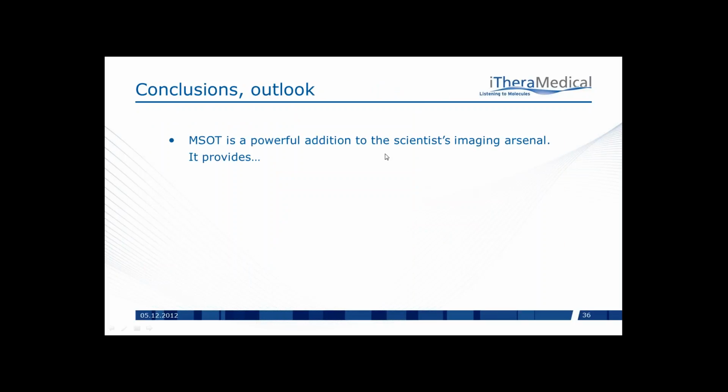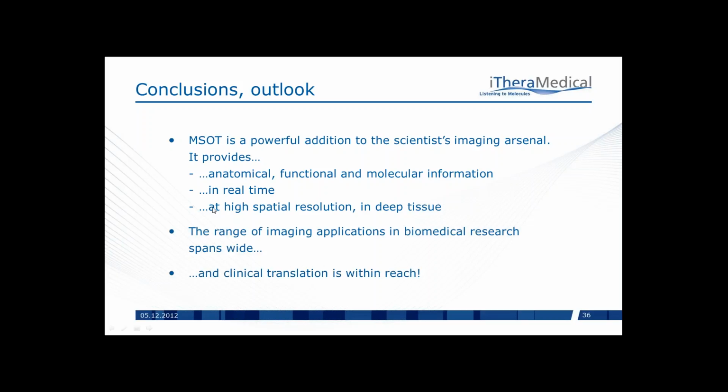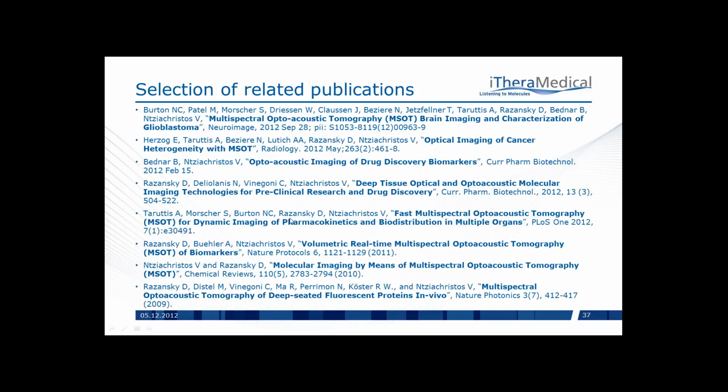To conclude, we believe that MSOT is a powerful addition to the scientist's imaging arsenal because it provides anatomical, functional, and molecular information in real time and at a high spatial resolution and even in deep tissue. The range of imaging applications spans wide, and clinical translation is within reach.